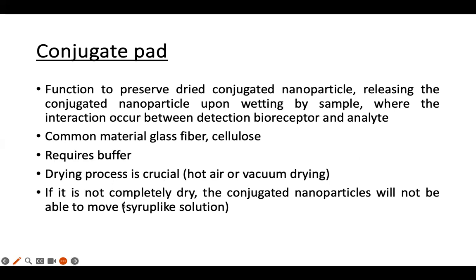So again, the dry condition is mentioned here. For lateral flow production and maintenance, the dry condition has to be there. So the final product usually has to be kept in an aluminum pouch, okay, to make sure that it is dry.